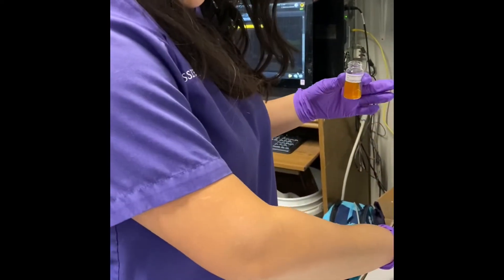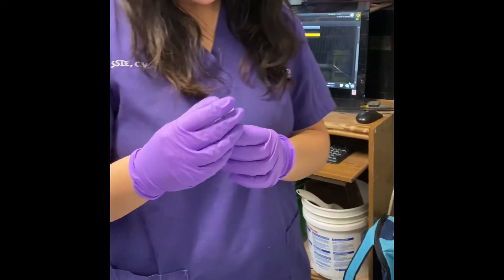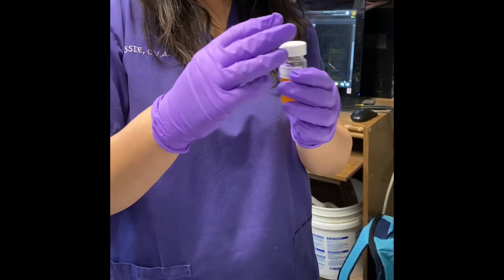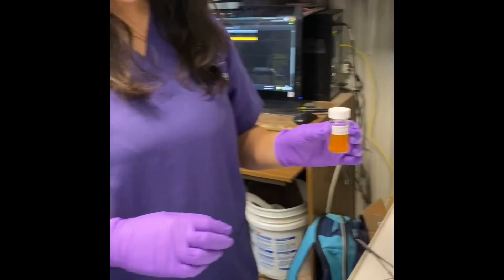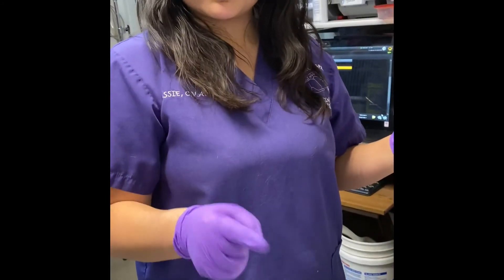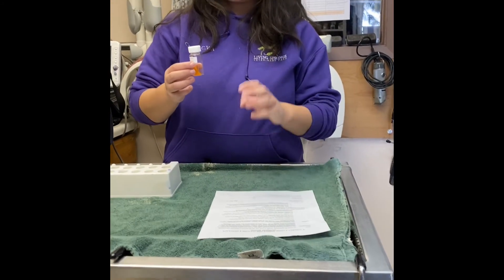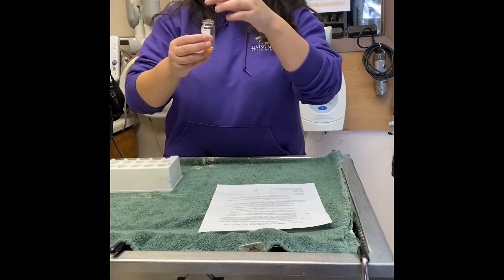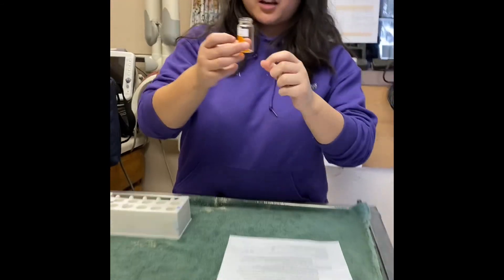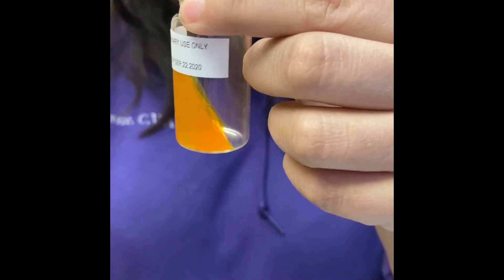With that, I'm going to go ahead and leave it slightly open, let it sit on top for a bit, put it in a good place, and then I'll come back in about a week to see if anything grew. So I went and took my DTM culture out — it's been about a week — and just from looking at it, it didn't turn that reddish color, so it looks like it is negative.